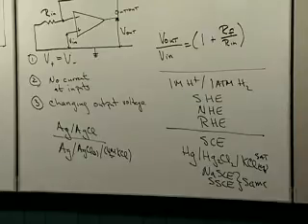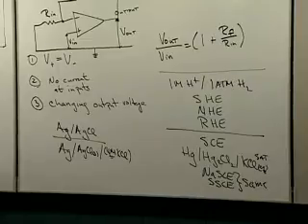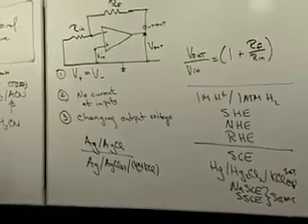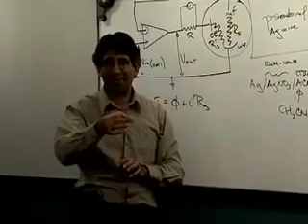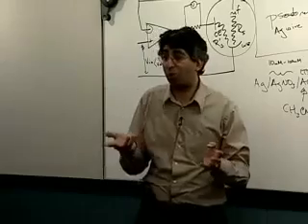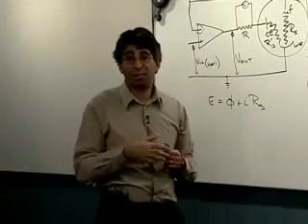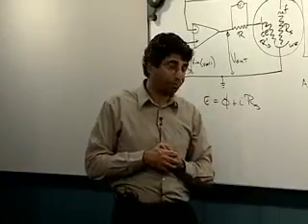It doesn't bother you. And then finally, the other possibility is just pull your capillary tip, your reference tip, out into a capillary. And you get a fairly slow, it's nothing like a ceramic frit or a cracked bead, but you get a fairly slow transfer of solution through a good capillary. And it's only moderate impedance. And so if you wanted to, for example, do a high-speed experiment, that's another way of getting around that. Just have a capillary at the end of your reference.